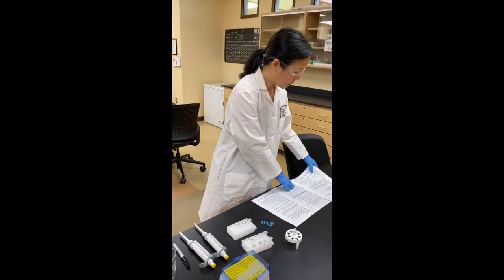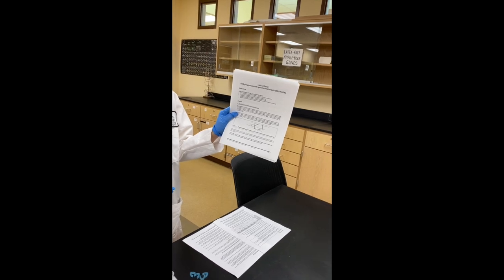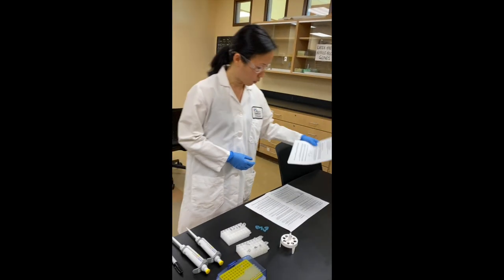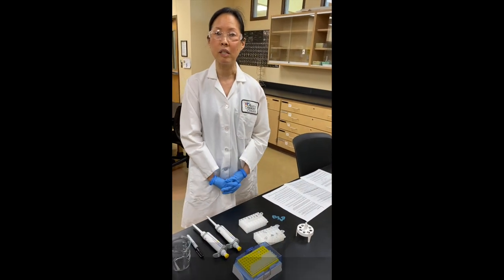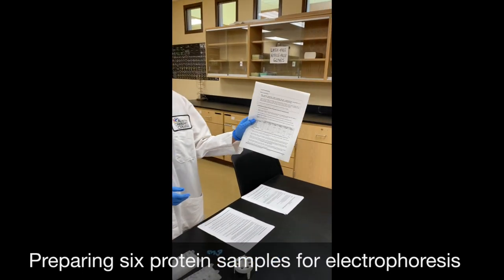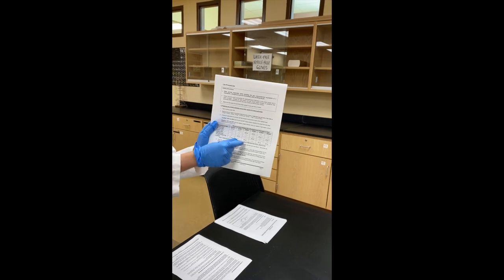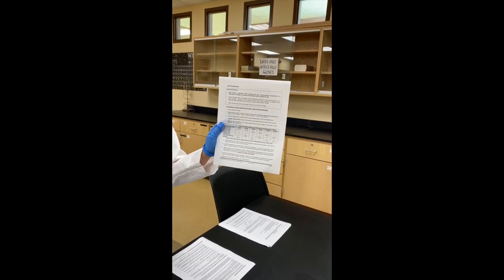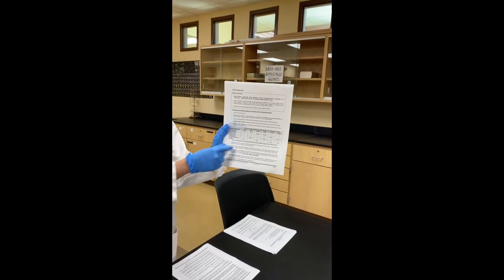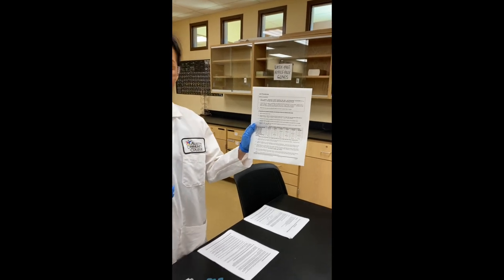I'm going to be following the lab procedures that you probably already have in hand for Lab 8, Day 2. The procedures start off with putting together six different protein samples. In order to put them together, using the recipes in Part 1 of the lab procedures, there's a table. Each column describes the ingredients to add to each protein sample. Let's talk about what the potential ingredients might be.